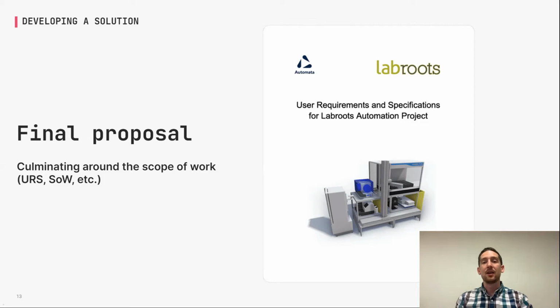It can also be referenced as the statement of work or scope of work. But this is going to be the project charter, a document that outlines, here is the system that we're building. Here are the devices that are going to be on here. Here's what we're providing. What devices are you potentially providing from your lab? What do timelines look like? And what is the system expected to do? Just to make sure that everybody's on the same page, that we're happy, and it's something that we can deliver effectively for you, that you're happy. And this is really an assay and a solution that's going to help your lab immensely.